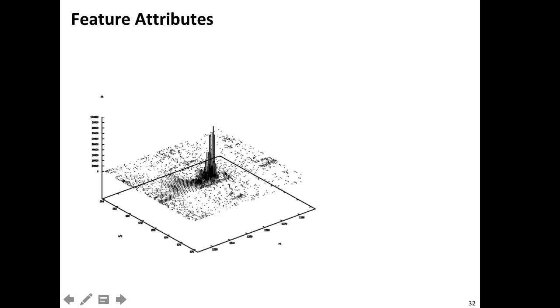The idea of most of these feature finding algorithms is to start with the stuff that is easy and then work your way down until you hit the noise, and eventually you need to stop, and there are different criteria for doing that. How would we describe that?